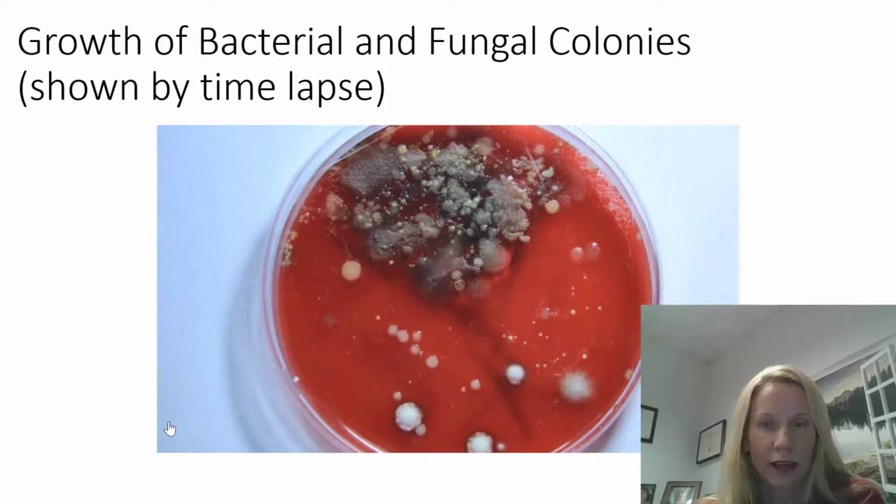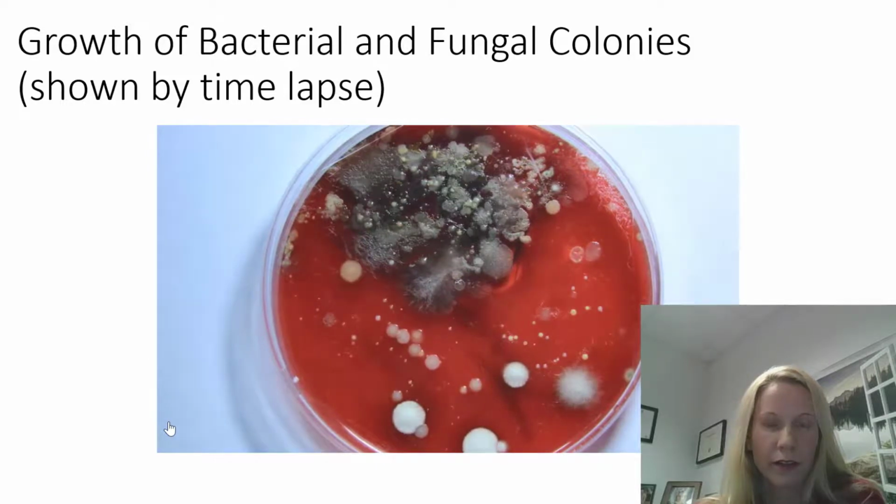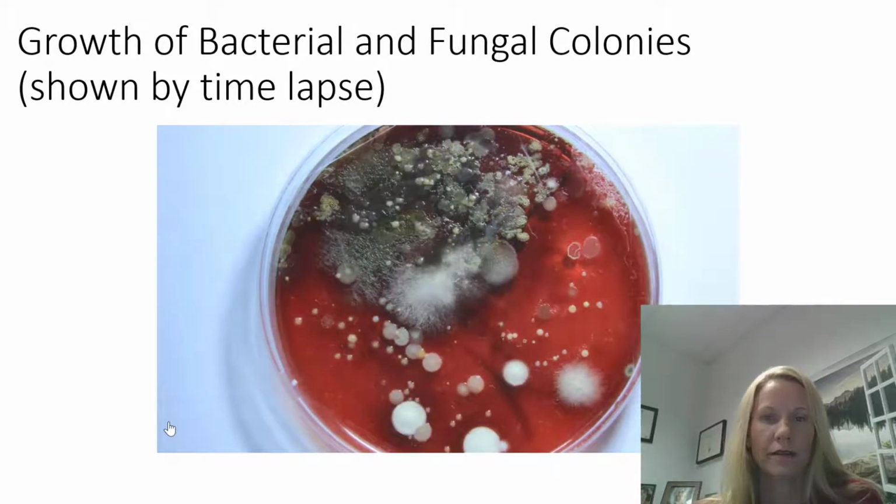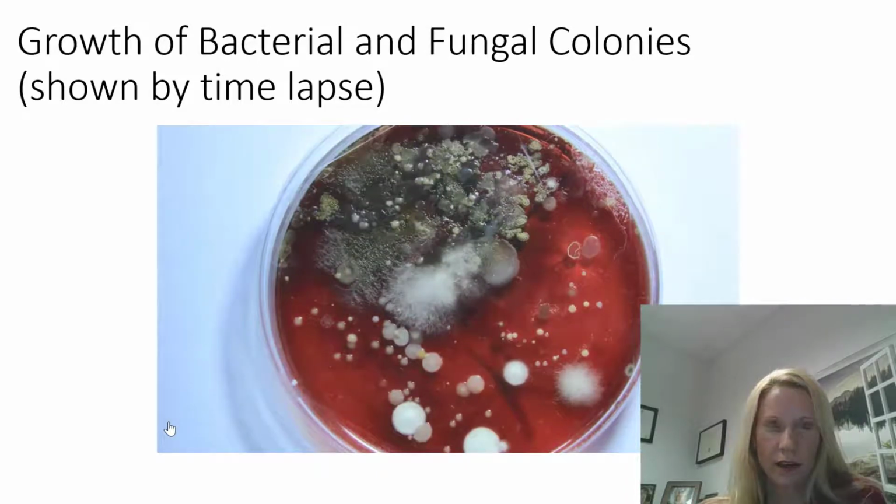And we see that these different shapes, now we call these colonies, are different colors and textures and sizes. And that's going to be important to how we actually evaluate the plates that I did in the experiment from yesterday. So let's take a look at those plates.